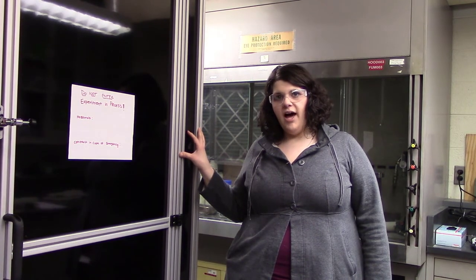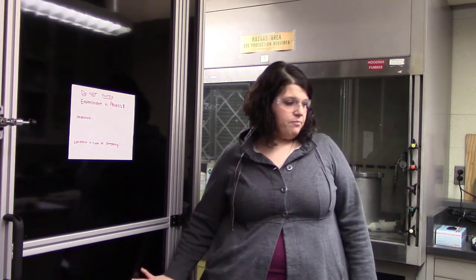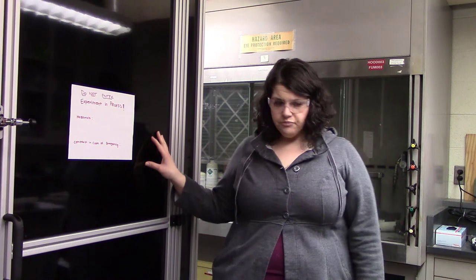Ways that we can keep ourselves safe while working with the chamber is we always work in pairs when we're down in the lab. That's so we can always let somebody know when we're entering and exiting the chamber, and so in case there was an emergency or an accident, there would be somebody close by and somebody that would be checking in on us. Our work within ESSI also changes quite a bit, and so our hazards within the chamber can change. So we need to be aware if we're working with a hazardous chemical where there might be an inhalation exposure, so do we need to wear a respirator when we go into the chamber? We also use quite a few instruments, and so are there a number of power cords or instruments on the floor that could pose a trip hazard while we're inside the chamber? And so just being aware of our surroundings and being aware of the dangers that are inside the chamber itself are ways that we can keep ourselves safe.